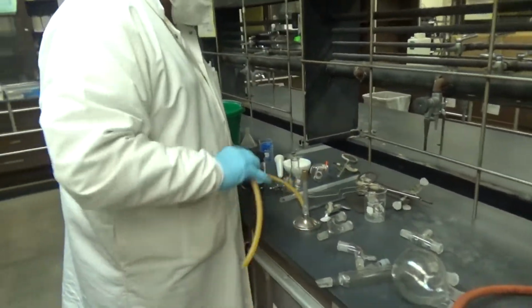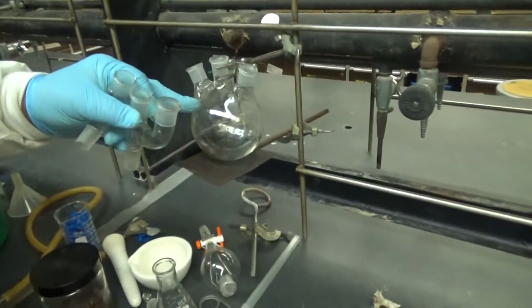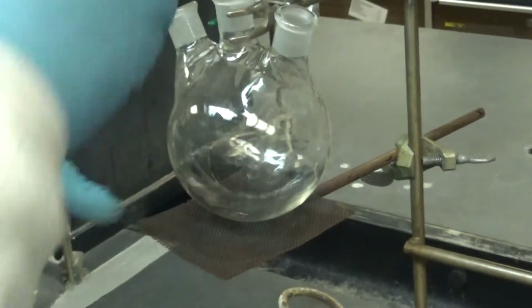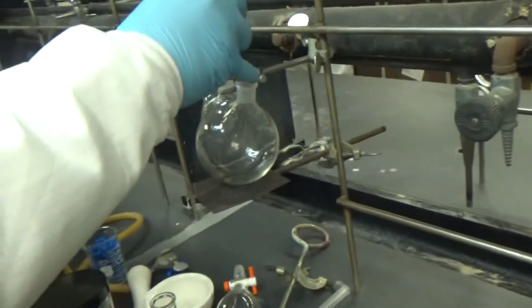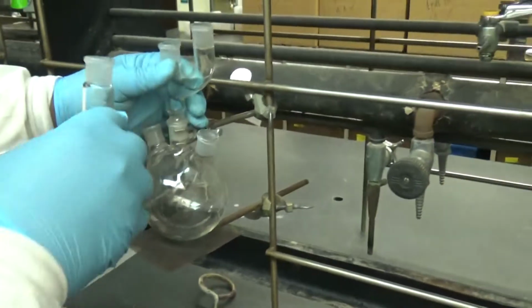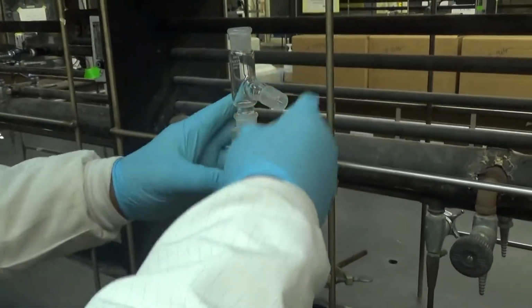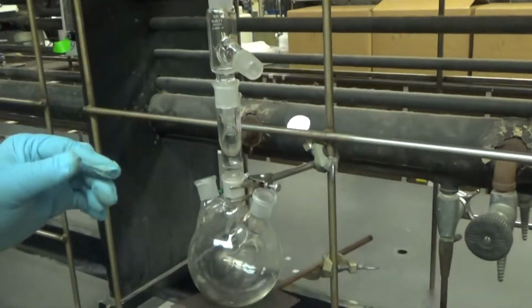So now I'm going to do the setup. You have the flask there? Yeah, a flask on top of the mesh and the clamp. It's clamped down. And I put the Claisen head and the distilling head. They're on the middle neck, yeah?